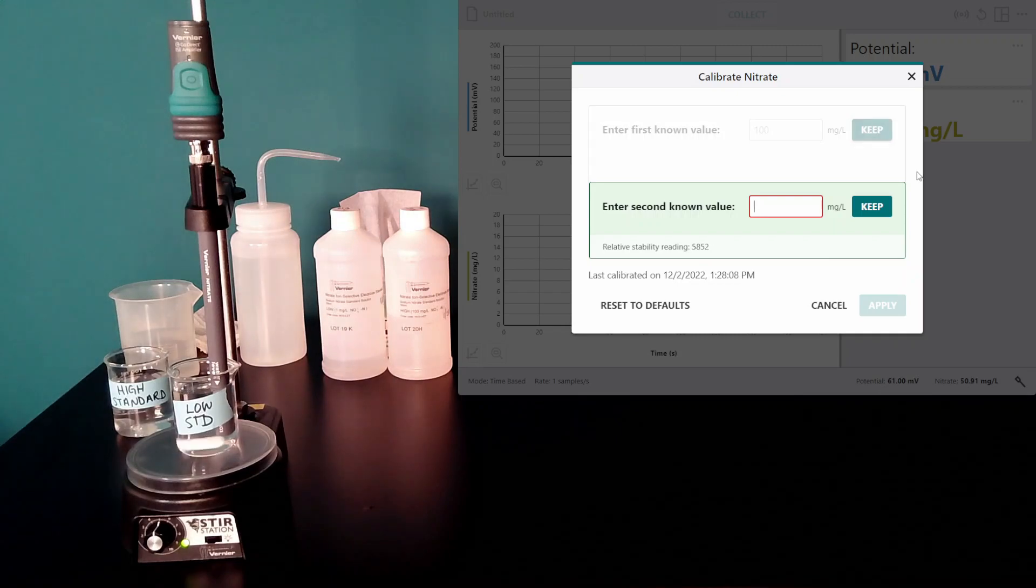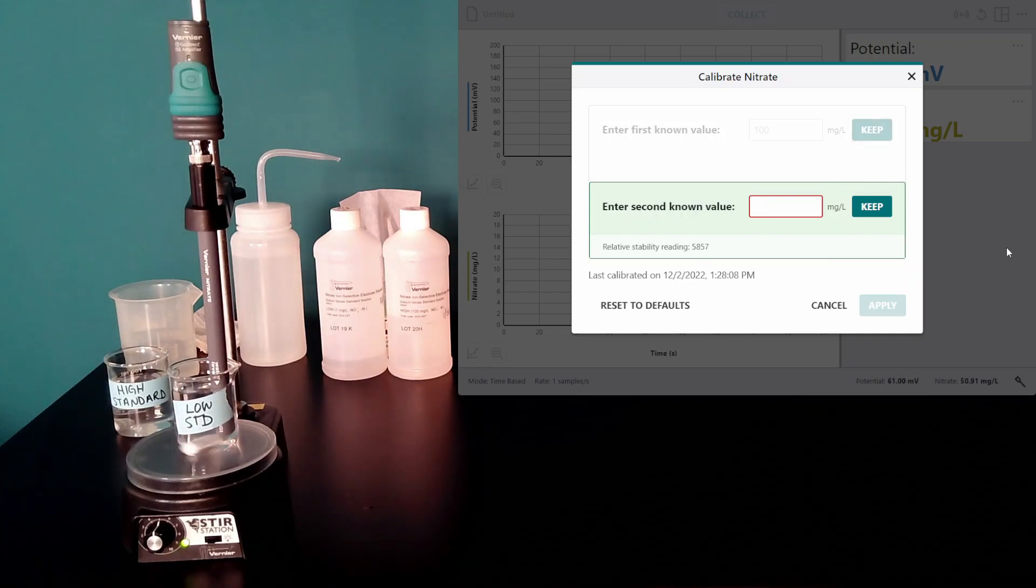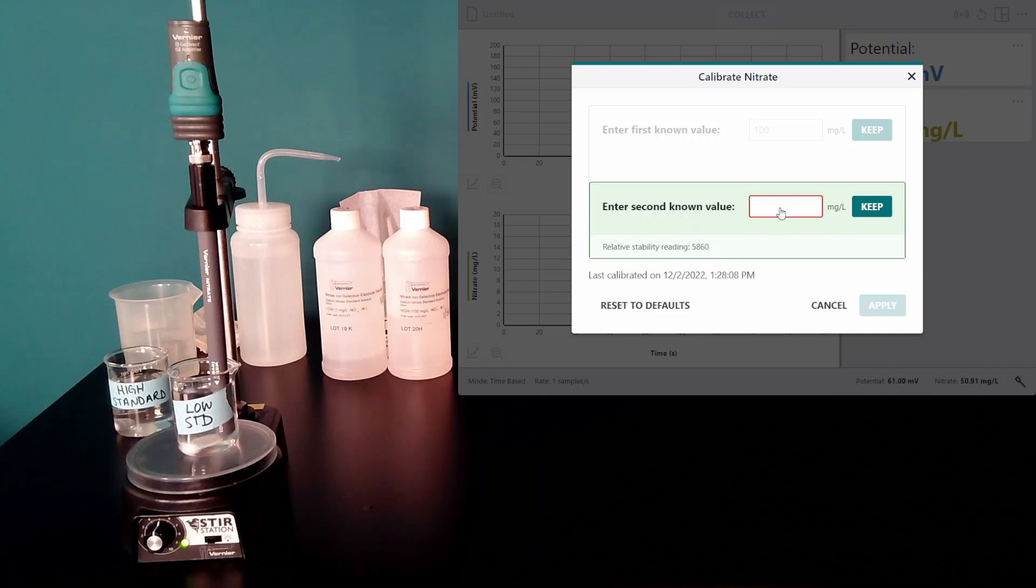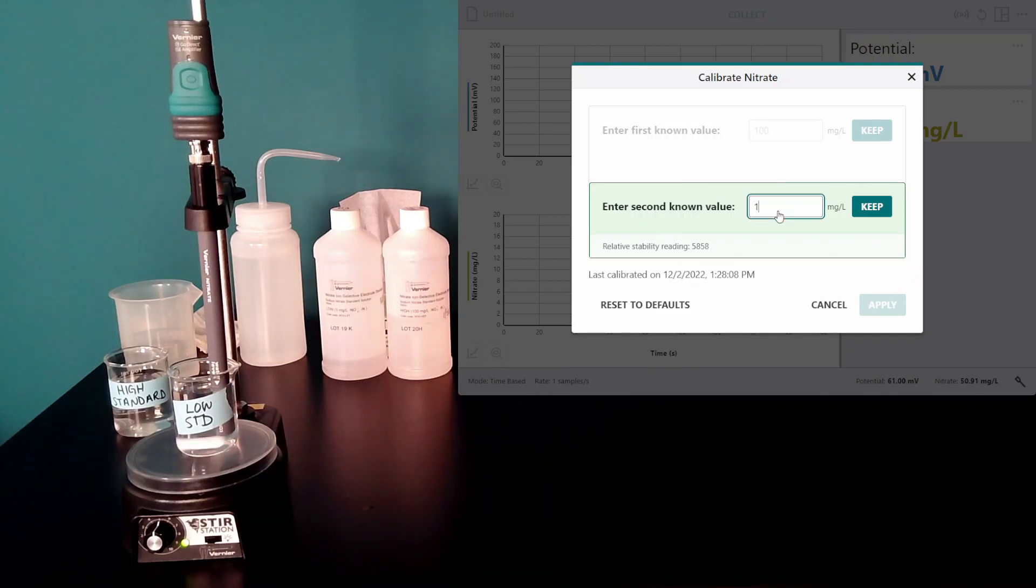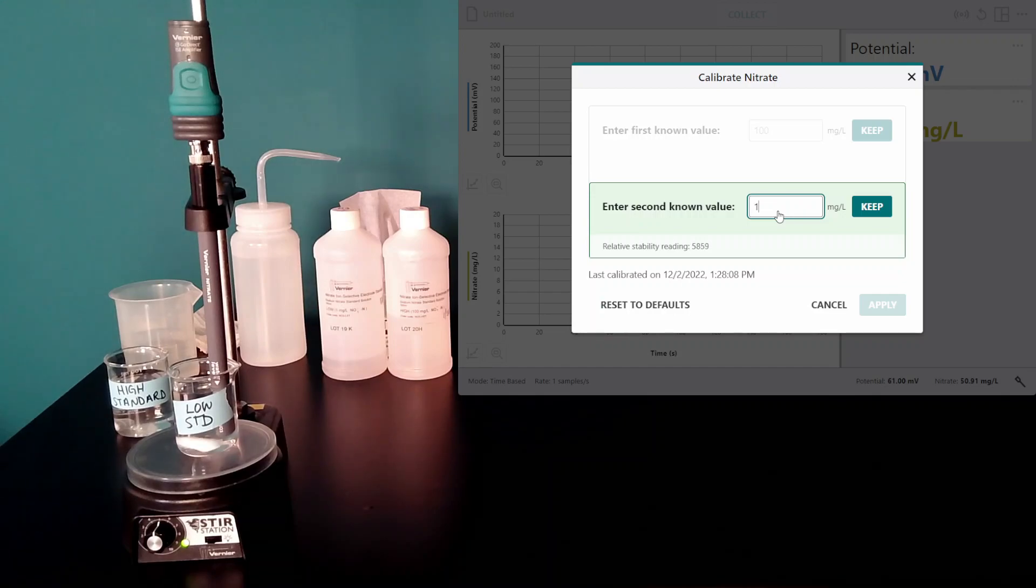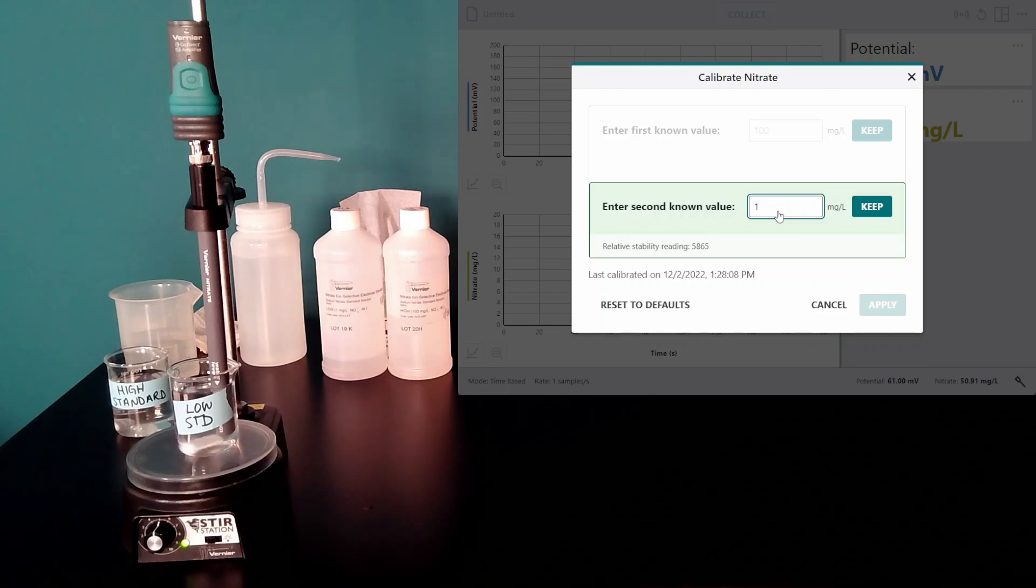I want to make sure this relative stability reading stabilizes before I type in the milligrams per liter, which for the low standard is 1. This can take a few minutes.